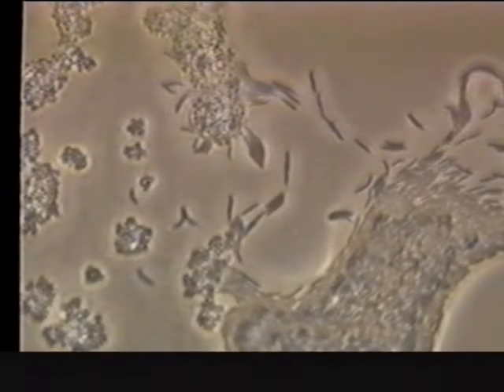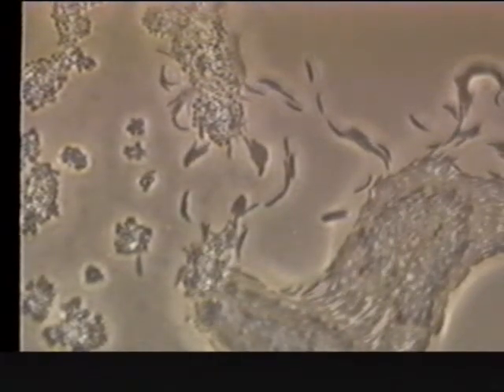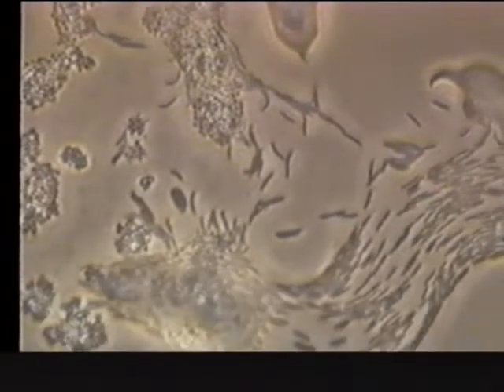Now you can see large groups of cells moving in. Whether they also detect some chemicals released by the lysing Micrococcus luteus is not known. Again, this is speeded up 5 times.